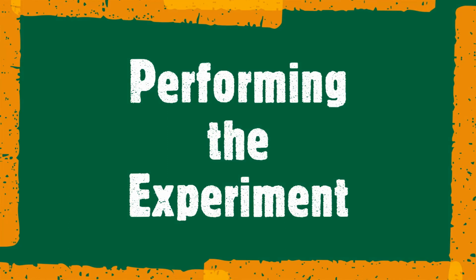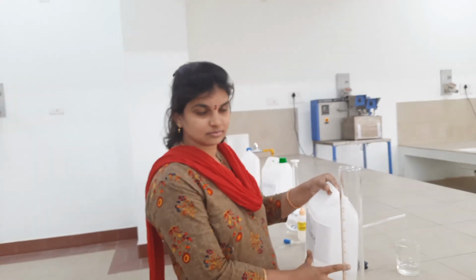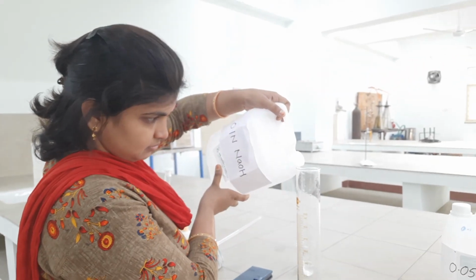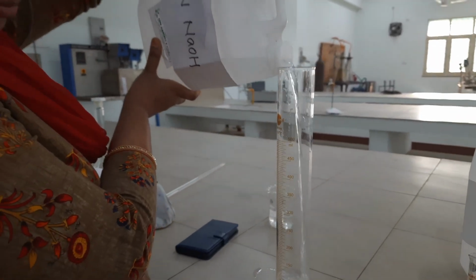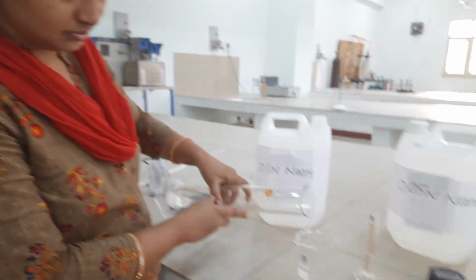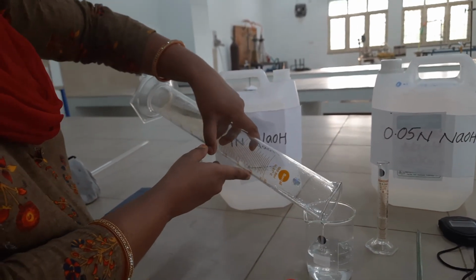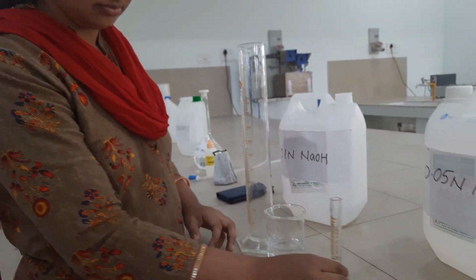Now we are going to perform the experiment. First, we measure 100 ml of 0.1 normal NaOH into a 250 ml beaker. To it, we add 5 ml of diacetone alcohol.